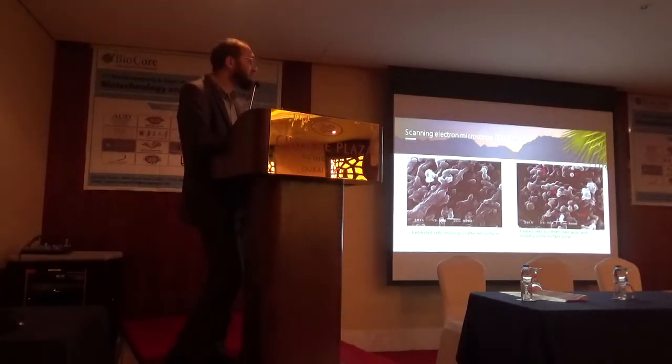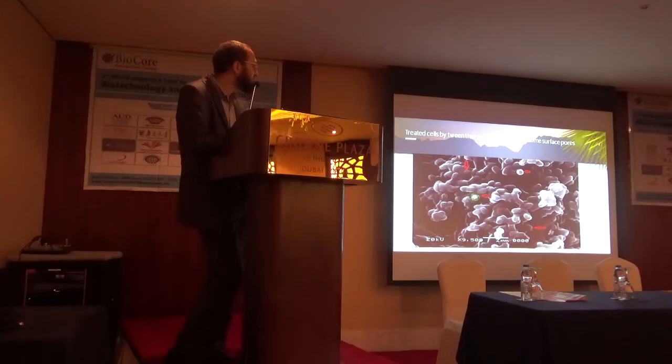This is the electron microscope figure that illustrates the several pores. This is before treatment. These cells are Salmonella typhimurium bacilli. All are intact without treatment, no pores. Here are some pores after treatment with Tween. We can notice some surface pores induced after treatment with Tween. Here are some surface pores.